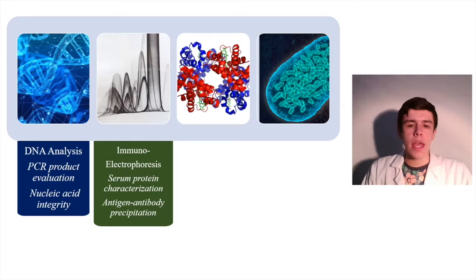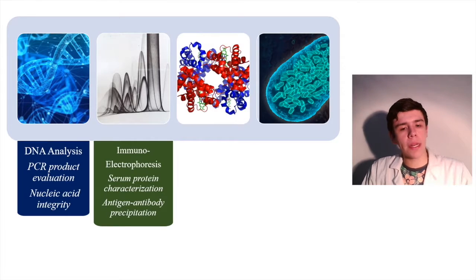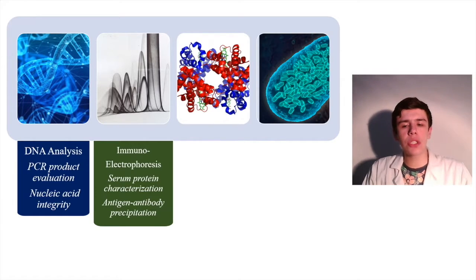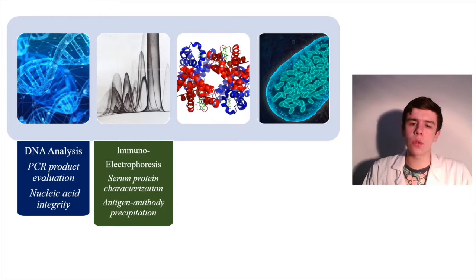Immunoelectrophoretic chamber. It is an analysis that involves protein characterization, based upon the separation of certain components being diffused against antibodies. It can be arranged in 1 or 2 dimensions. Precipitation patterns are later analyzed to determine antigen-antibody interaction.